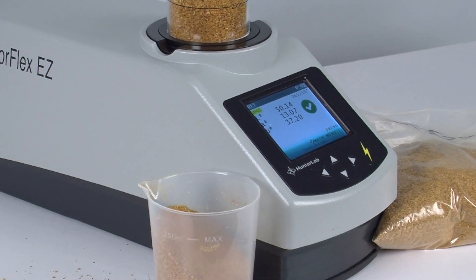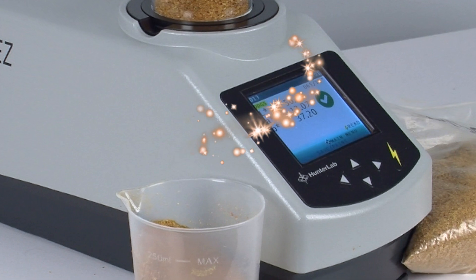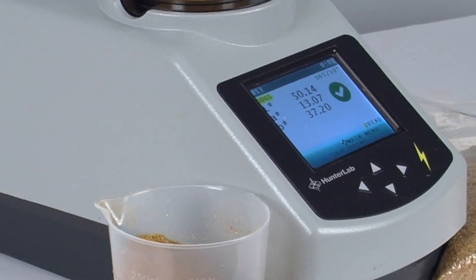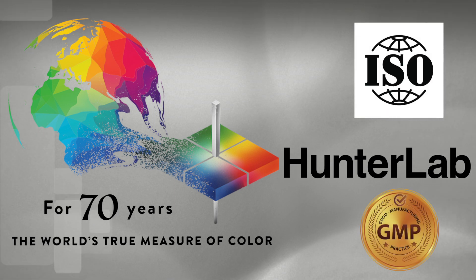The ColorFlex EZ is recognized throughout the food and feed industry as the gold standard color measurement device for DDGS, developed and made by Hunter Lab, ISO certified, focused on GMP, and known for making experience work.